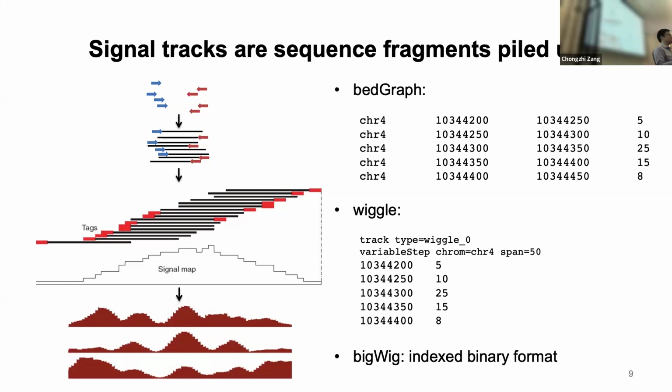If you're only interested in the coding gene expression level, single end should be okay. But nowadays more people tend to use paired end because it can give you more information, like alternative splicing.